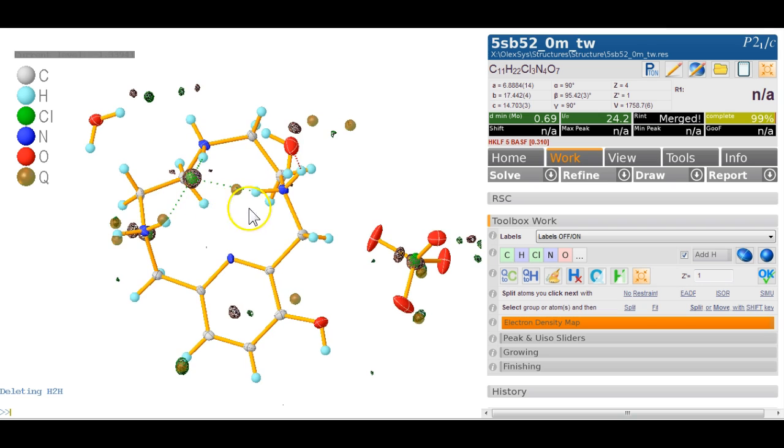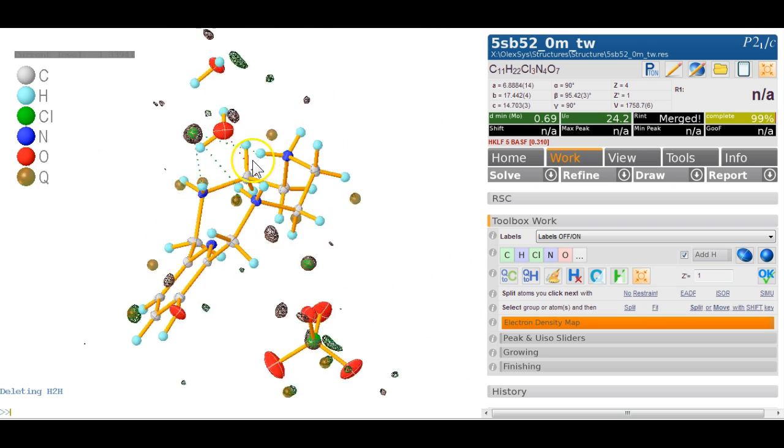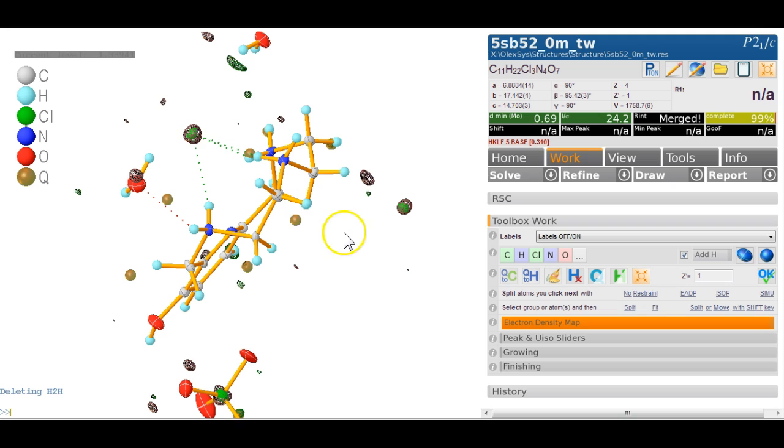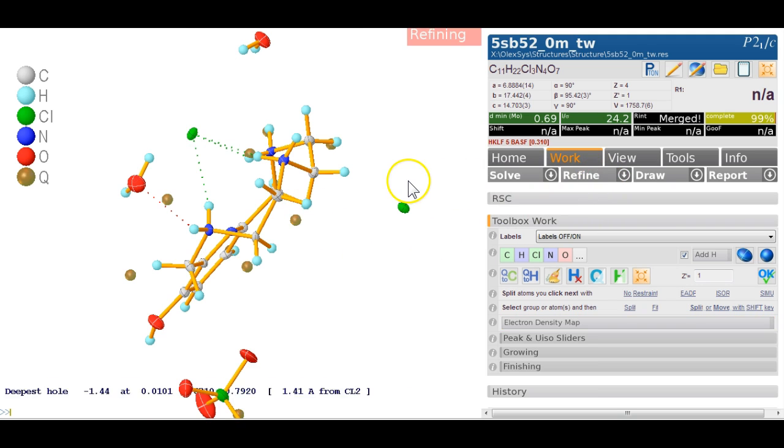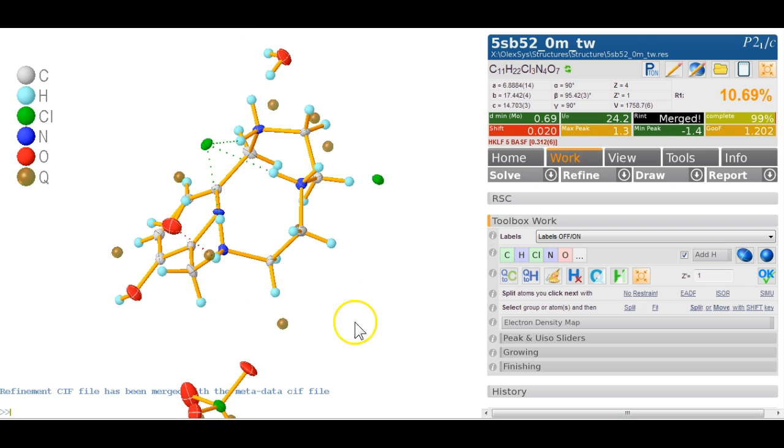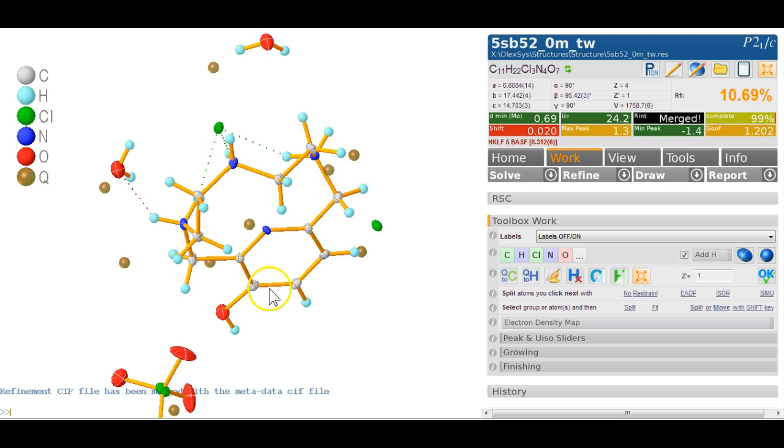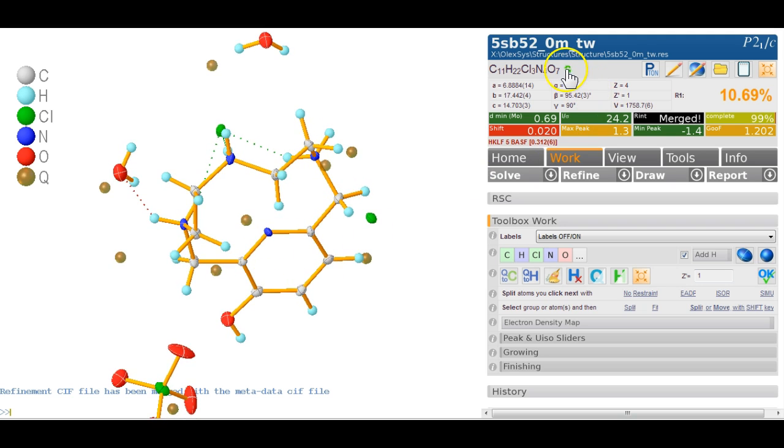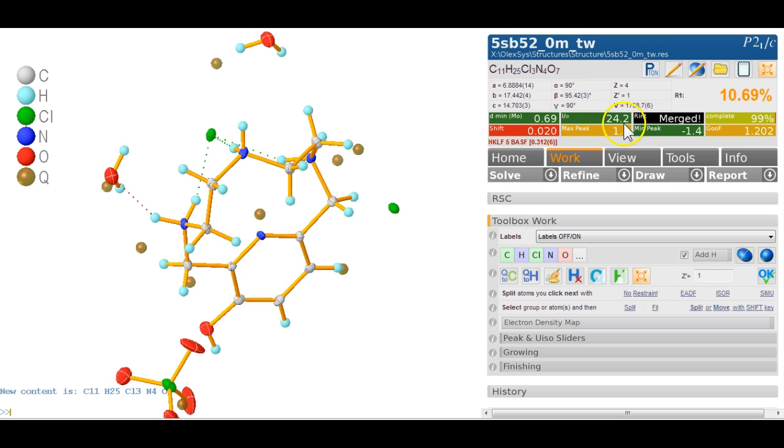We need another positive charge somewhere and I'm not quite sure where to get this from. So first of all, refine it and have a look at the output. So the R factors drop, which is a good sign. And where is the biggest peak? This will update the formula. The biggest peak is 1.3, that's quite significant and it's very close to this one here.